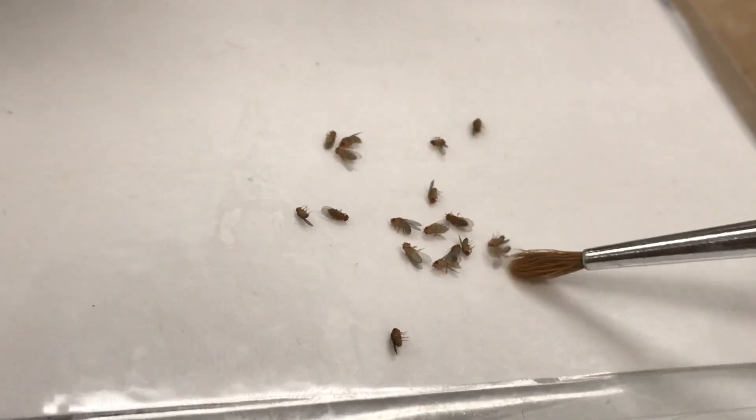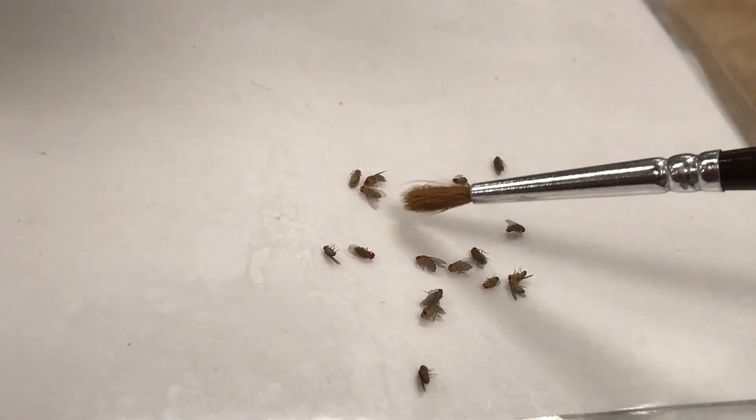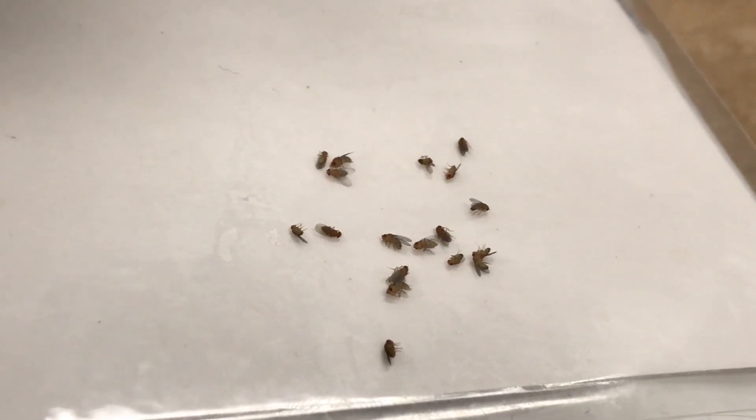You can move them around using your paintbrush. And once you have counted all of your flies, you have to put them in the morgue. Remember, this is very important — we don't want the flies to be flying around the classroom. Remember to label your vial and put it back into the rack because you will need these flies for next week.